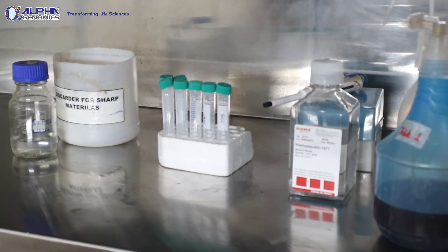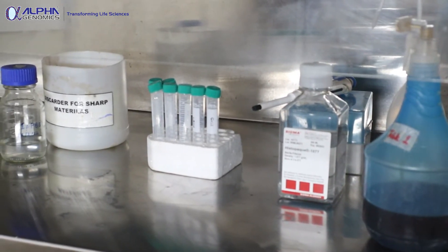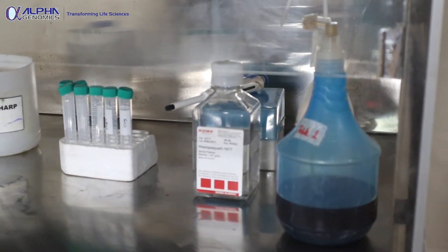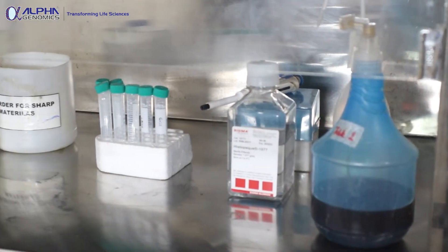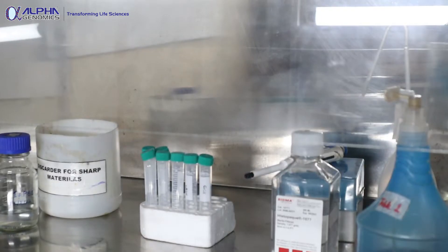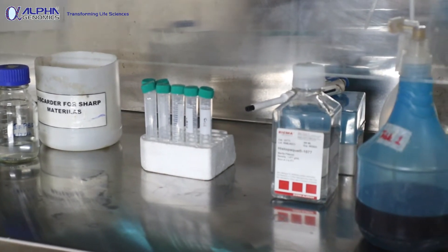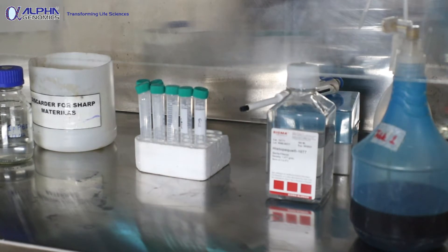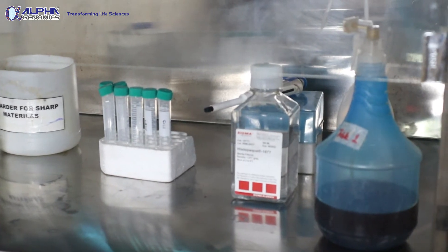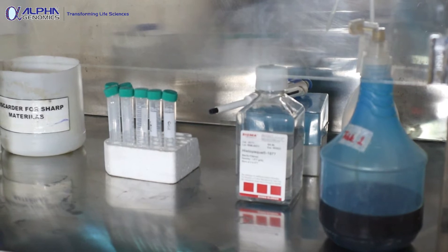Prior to performing any experiment, sterilization of this instrument is important. I have washed and wiped it with 5% bleach and sprayed a high amount of spirit. Now I'm going to turn on the HEPA filter and the UV light for 5 to 10 minutes, keeping inside all reagents and instruments — the falcon tubes and pipettes — to ensure any bacteria, DNA, or other contaminants are eliminated.